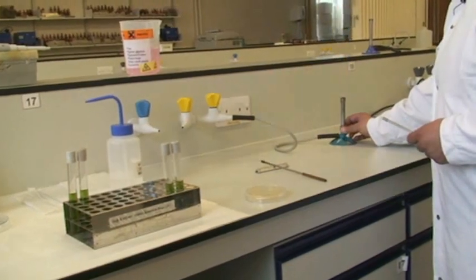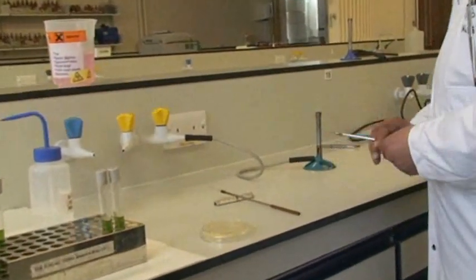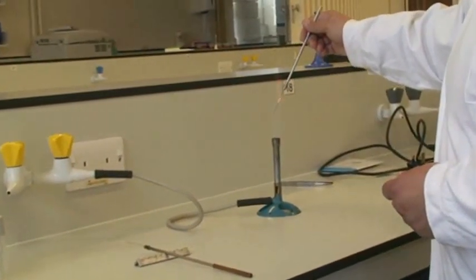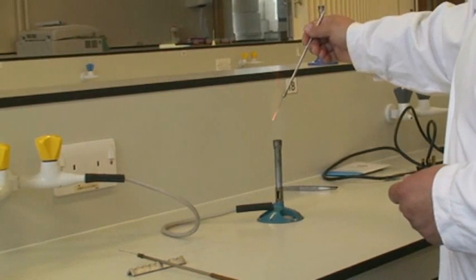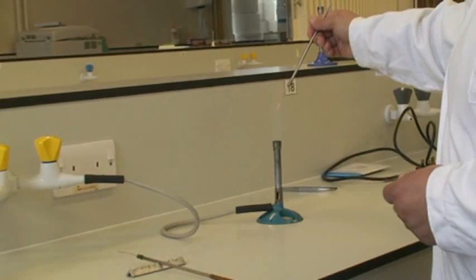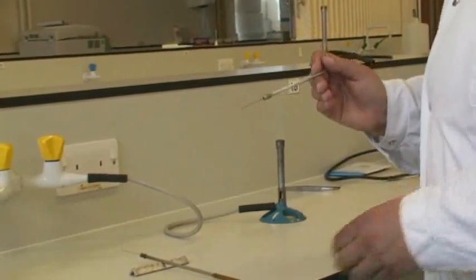I'm just moving the Bunsen again to the hottest part of the flame, sterilizing the straight wire till it's red hot, because you want to make sure that the only bacteria you're actually inoculating into those Hugh and Leifson's agar media are just the bacteria that's on here.